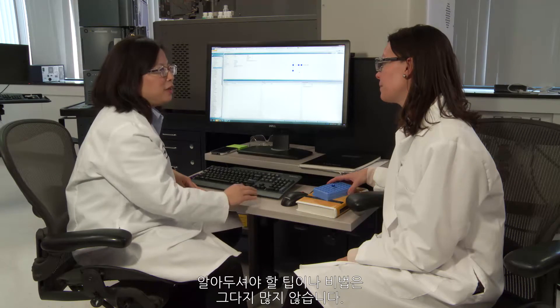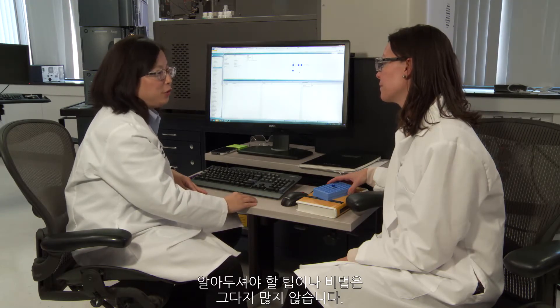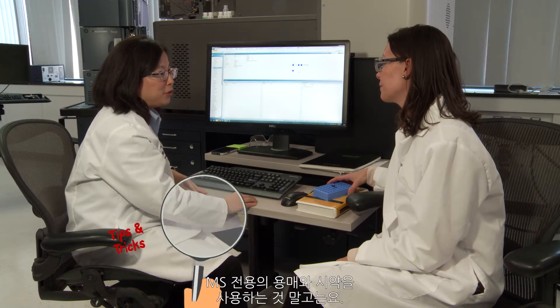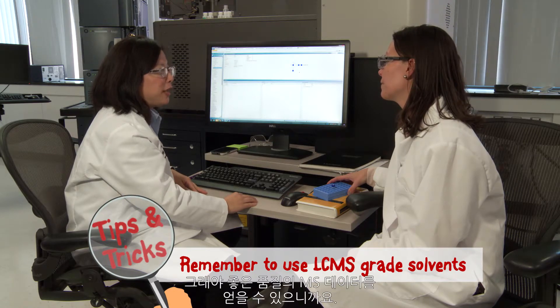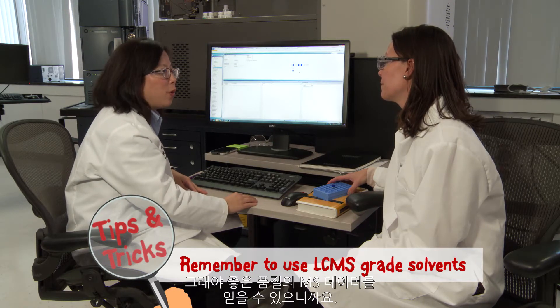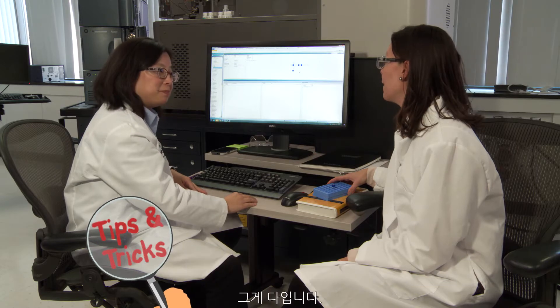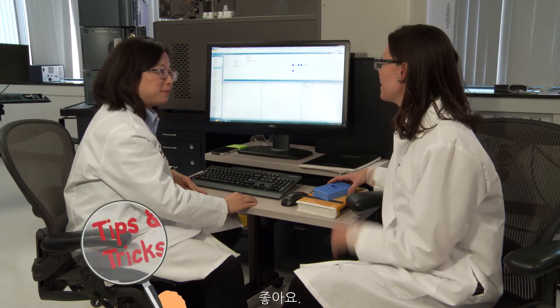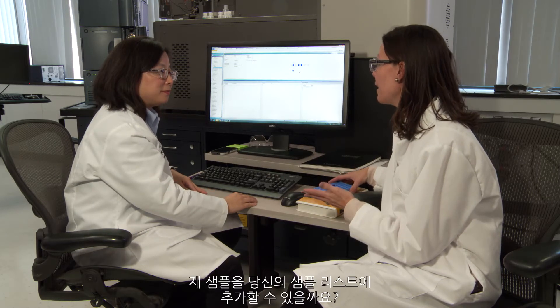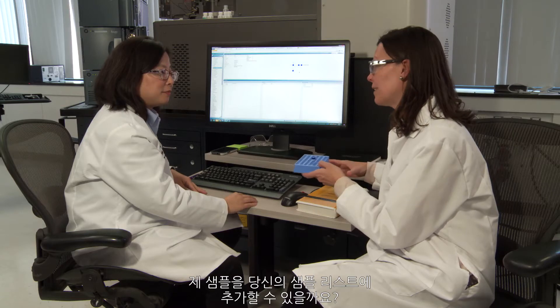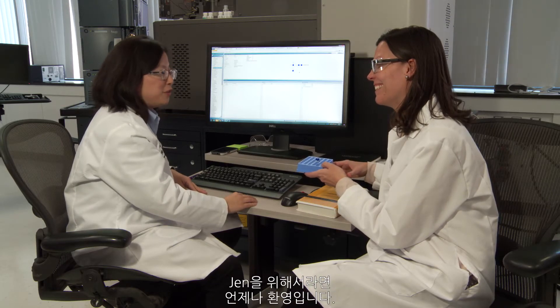There's really not much tips and tricks you need to know other than using MS-grade solvent or agent, because that will guarantee you good quality MS data. That's it. Well, since you already have your system set up, is there any way that you could add my sample to your queue? We always have time for a Jen.